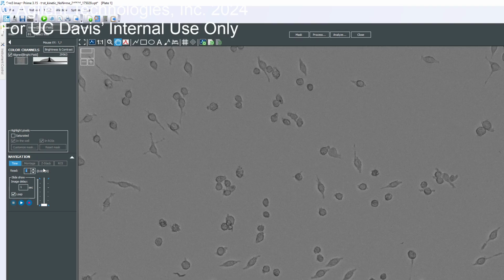Yeah. So there's one more thing. That one is literally the last thing from my end that I want to show you guys. If someone wants to take control, then I can walk you through it. I just want you guys to know what the beacons are, how you can apply the image stitching and everything. So I'm just going to show you all the options that exist.